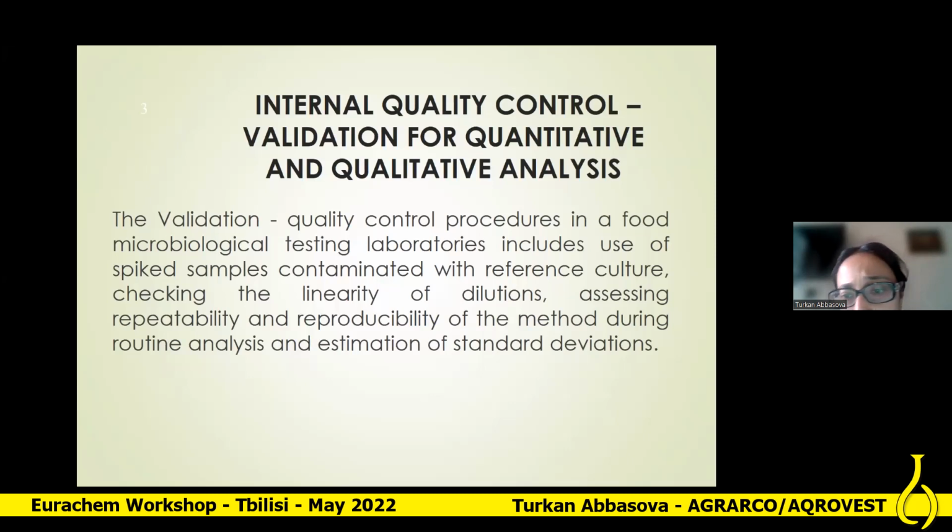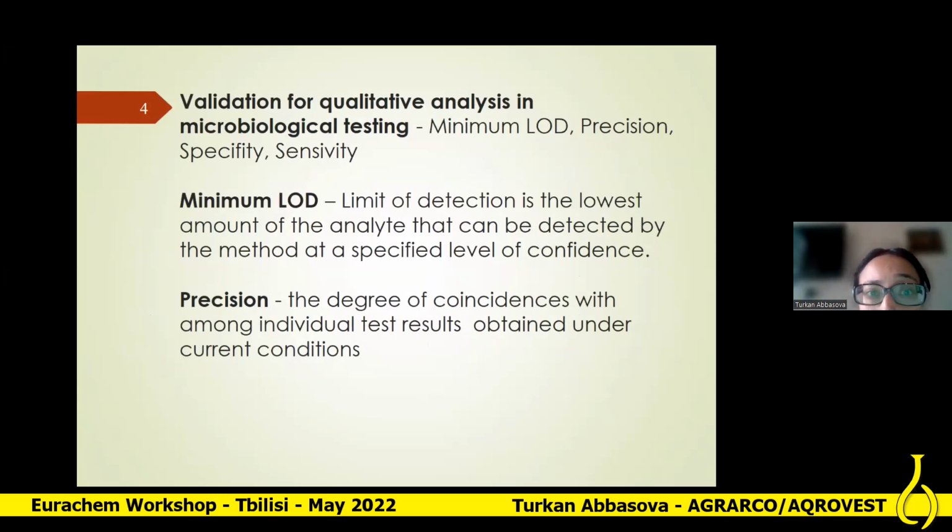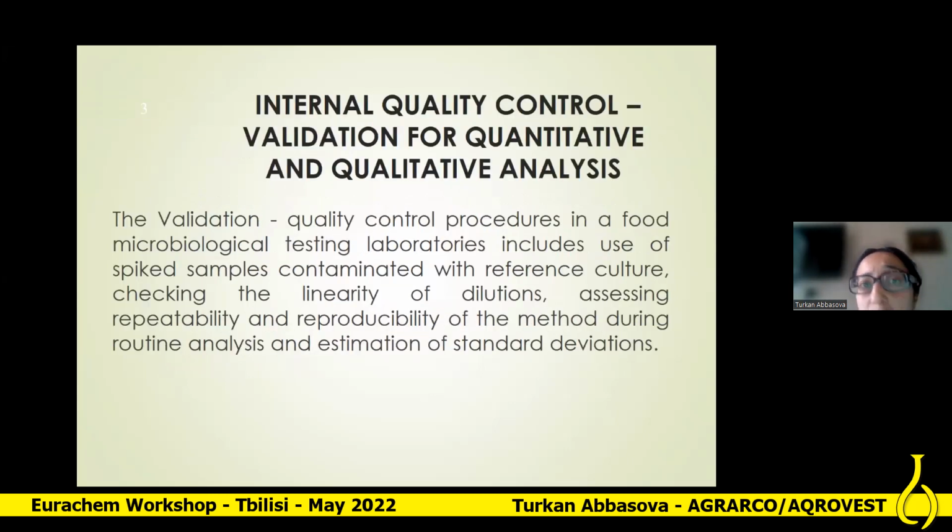The validation process, as you know, is a very big subject, but it includes internal quality controls. I would like to inform you that this type of quality control is concerned with qualitative analysis.